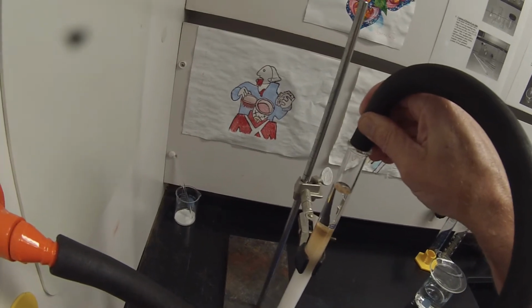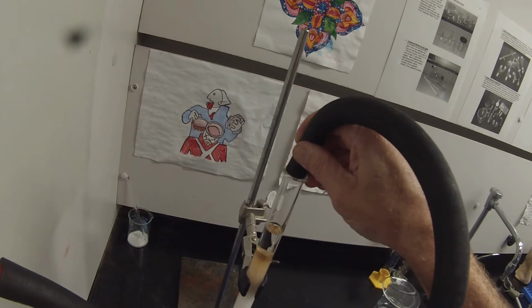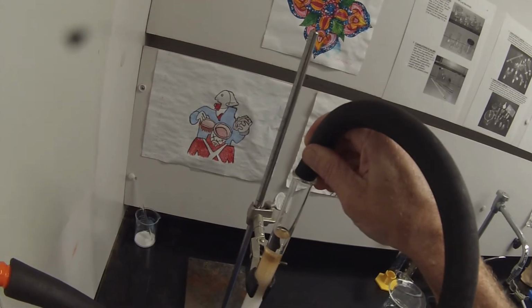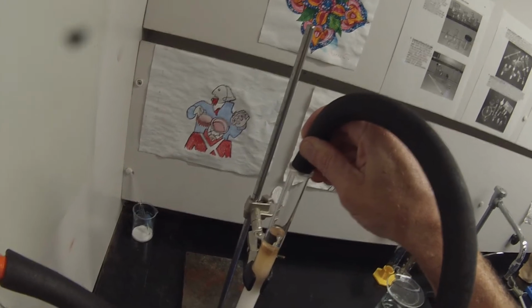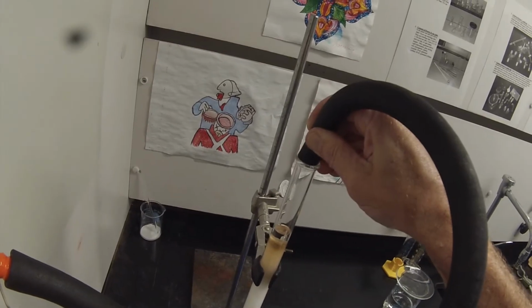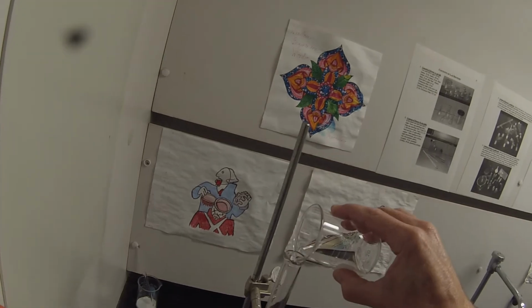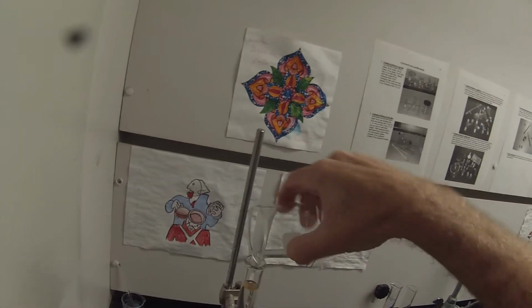If you're a graduate student in organic chemistry, you run one of these every day. Maybe two. Because chromatography is probably the most common method for purifying compounds, especially liquids. If they're high boiling and you can't distill them, column chromatography is pretty much the only way. For solids, you hope you can recrystallize. So my first 5 tubes are going to be pretty much pure petroleum ether. And I don't really expect anything to come off in those first 5 fractions.